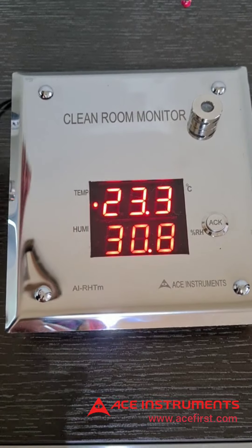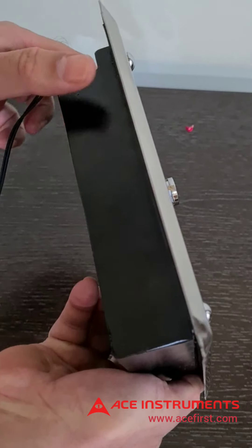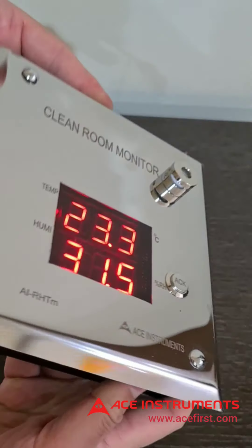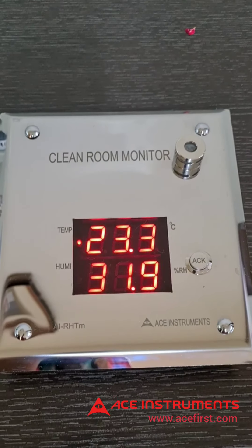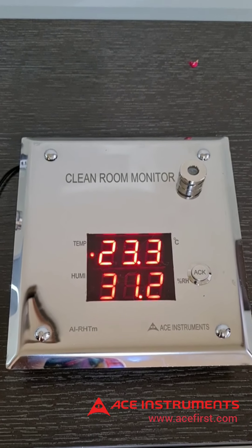I'll show you how it looks from the back. This is just a 35mm depth instrument, and this is the MS back box. It has cable entries at the top. The plate is flush, and the menu programming, buzzer alarm setting, and Modbus communication settings are all accessible from the back.